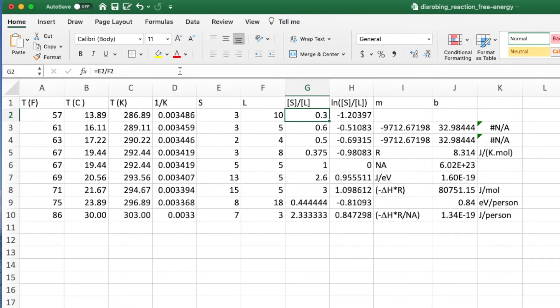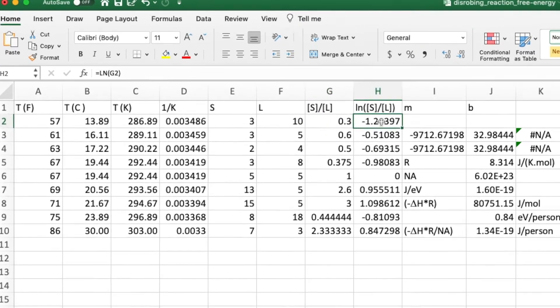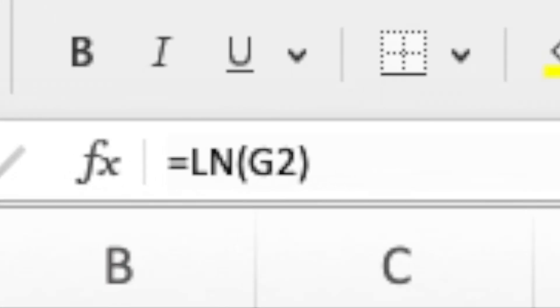After you have entered the data, create a column and compute the log of K. That's done in column H here. Selecting H2 shows the conversion.